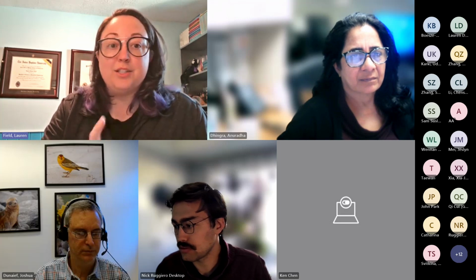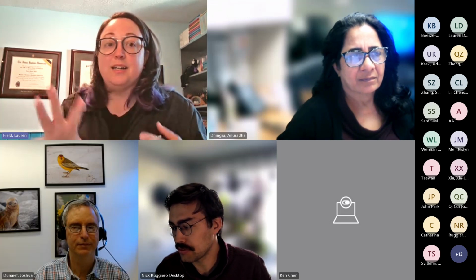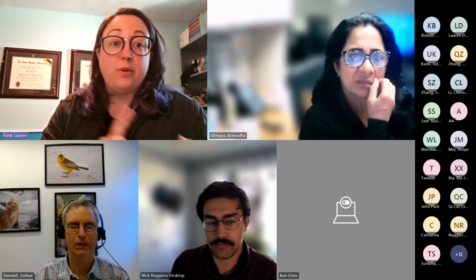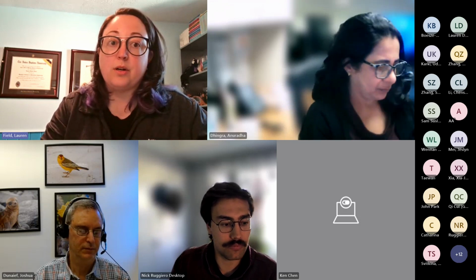It's doing a combination of denoising, decon, some declarify. It's kind of like a little magic wand that makes things look really pretty, but I wouldn't say that it would be consistent between every image that you're taking. So it's mostly to say, this is the prettiest I can make this picture look to display it, but I wouldn't do any sort of quantification or analysis on a Restore AI image.